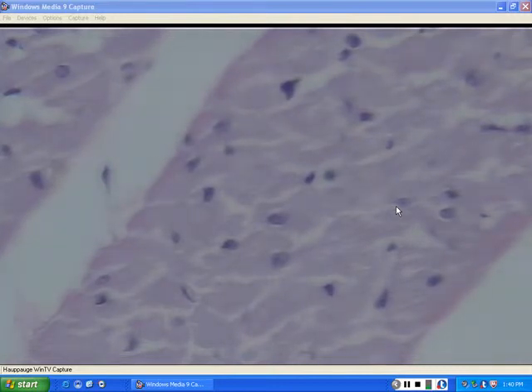It's a little different. But its major functions, since it is an involuntary muscle, it has a variety of functions of moving food through the digestive system and basically controlling how things can get in and out. So it has a wide variety of functions, but this one's a little uneventful, as it lacks all those other structures. It's a little more simple to find, but the best way to see it is zoomed out a little bit more. And the only way we can try to give descriptions of this, because you can't see the individual cells very well, is that it does have this carved meat appearance.